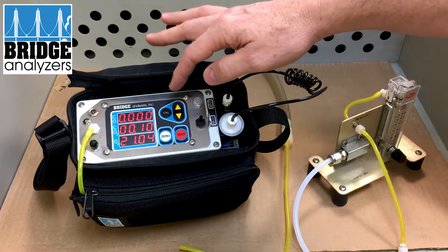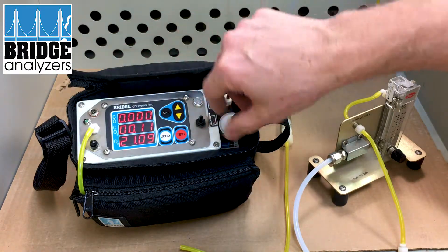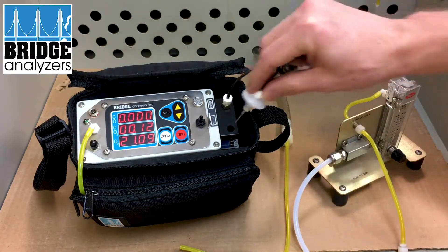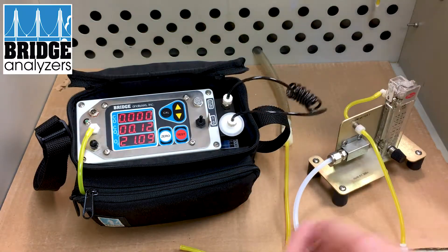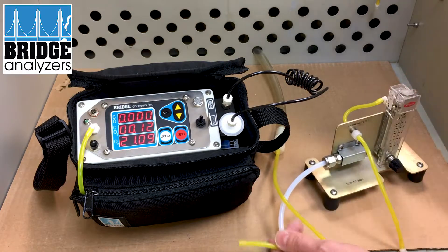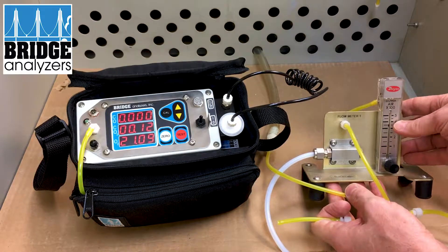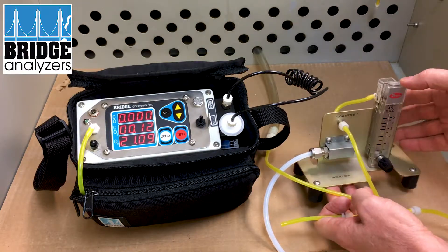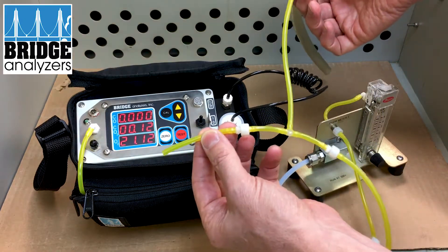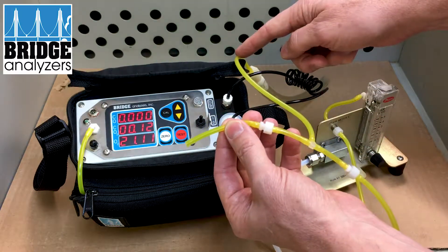When you turn it on and then zero, it'll be running in continuous mode, so the pump is running all the time, and now I'm drawing from the needle. I can turn on the calibration gas — I have a calibration stand here. I'll turn on my gas, and you want to be at essentially 400 cc's a minute.